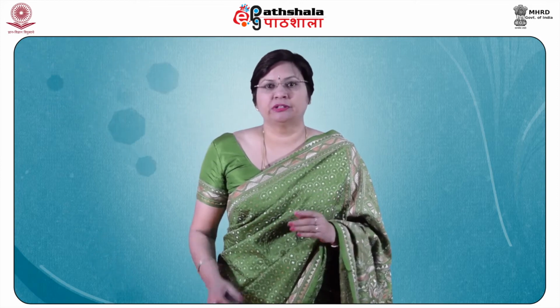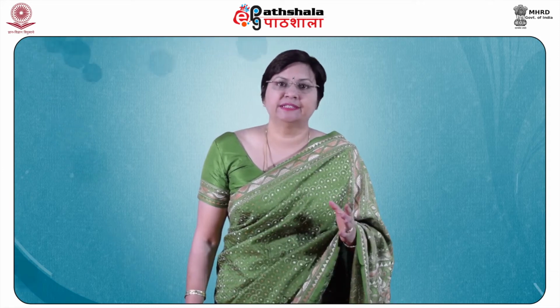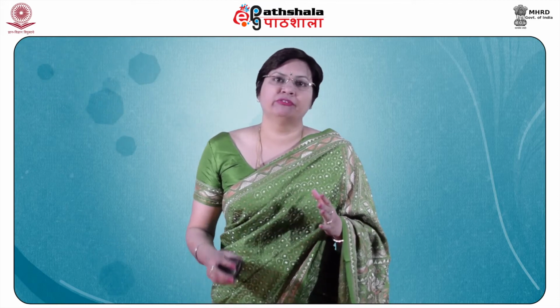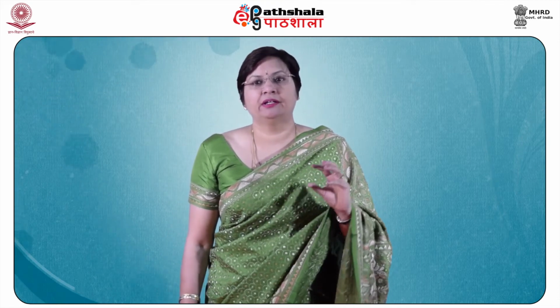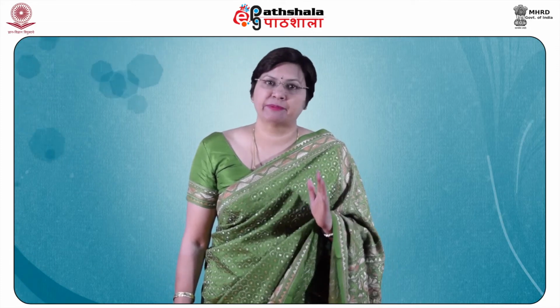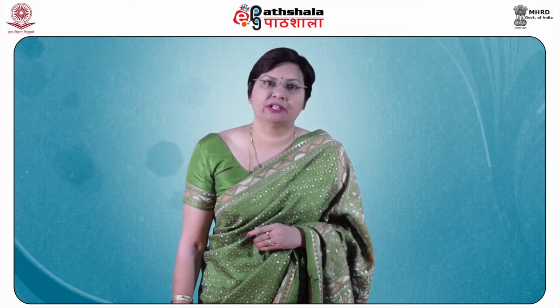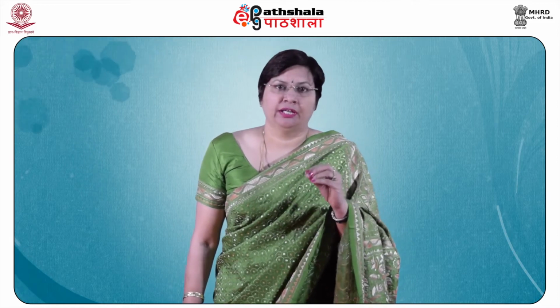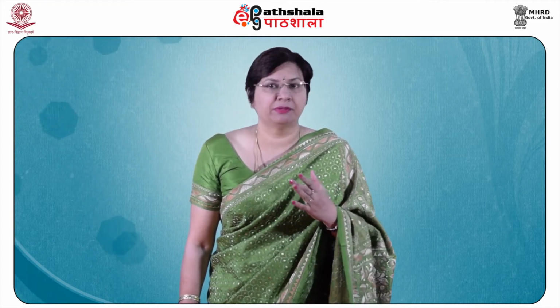The knowledge and concept of UV visible, IR, 1H NMR, 13C NMR and mass that you have learned helps us in solving the problems based on the experimental data. And this will help us in analyzing the experimental data to elucidate the structure of any given organic compound. While analyzing the data of any given compound, you must keep some points always in mind, which I have told you earlier also, but let me repeat.